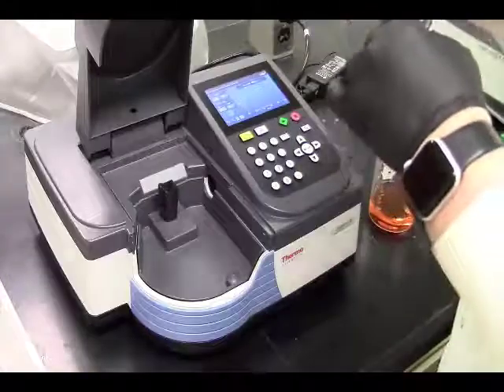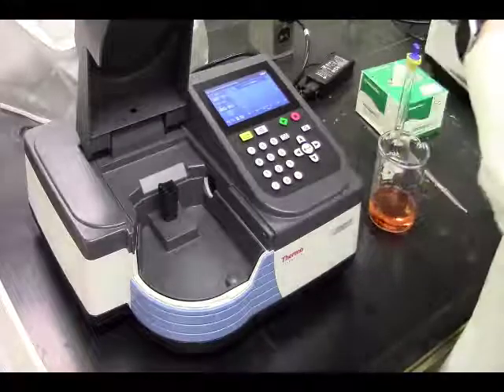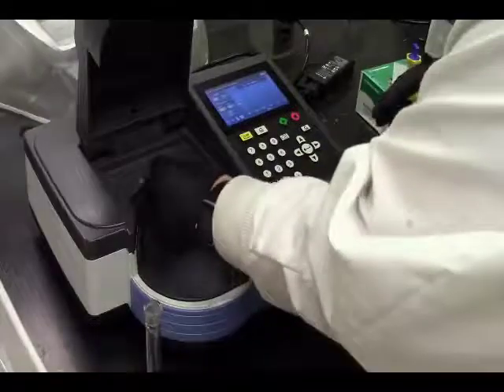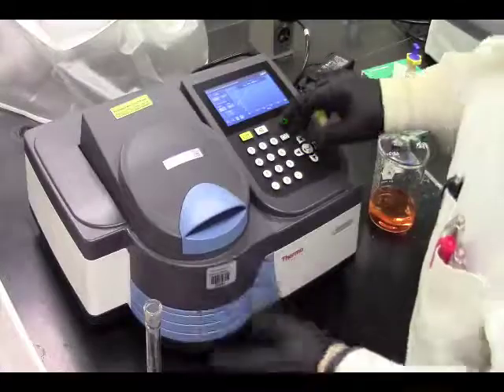We're going to start off with this one. We'll just rinse our cuvette really well. Rinse with the first. Fill. Pop this in. And read.